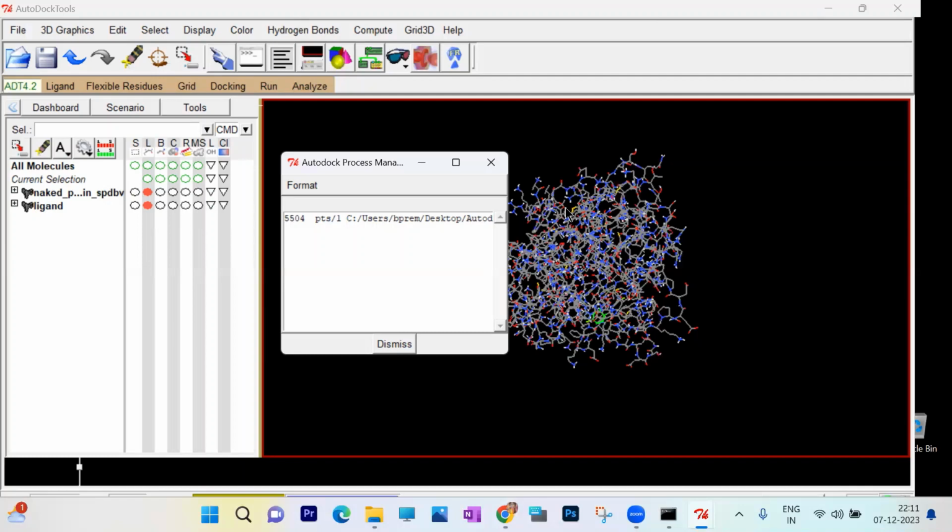When you want to run another ligand, you have to go with the same steps. You have to create the grid box. In this case, since we removed the ligand and again we are trying to simulate it, it is going and placing inside that place where it was residing. But when you use another ligand, it is not the place for that. It will not show that. It may be outside the protein also. But if you set the grid box XYZ dimensions, the ligand will be simulated in that space only. I hope you understand this concept. That is why we have increased the grid size, so you can accommodate a bigger ligand in the space. So I hope it will give an outline of this up to the AutoDock run.